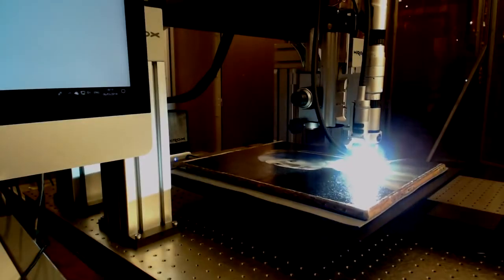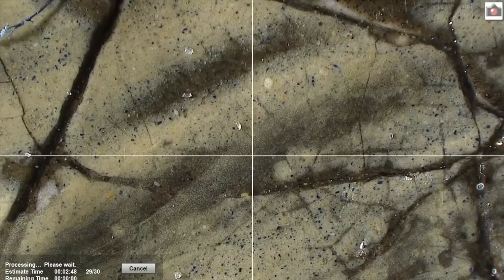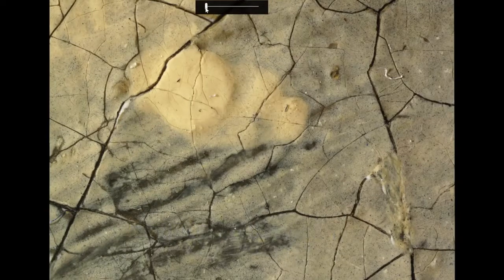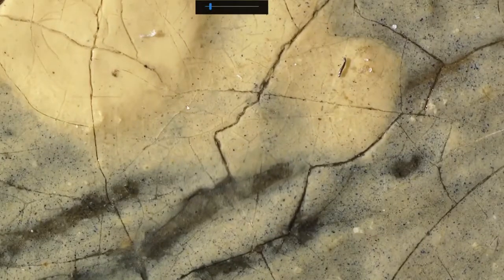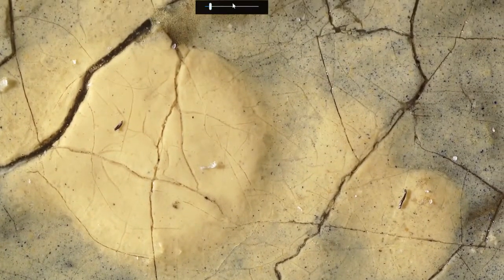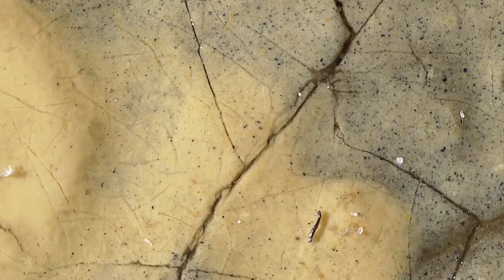The Hirox software is then automatically moving the lens up and down with very high precision, capturing a series of images at different focus and combining them in one fully focused image. The motorized XY stage is then moving to the next position, creating a high-resolution panorama. In total, 10 key areas were captured as all-in-focus super high resolution to create 3D stitches of those surfaces, where 1 pixel equals 1.1 micron.